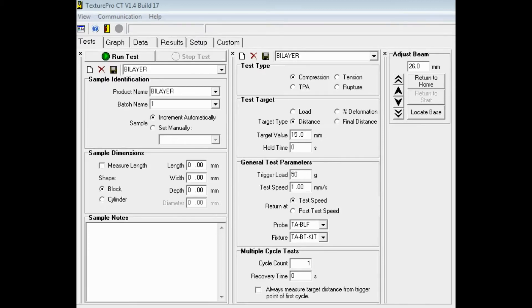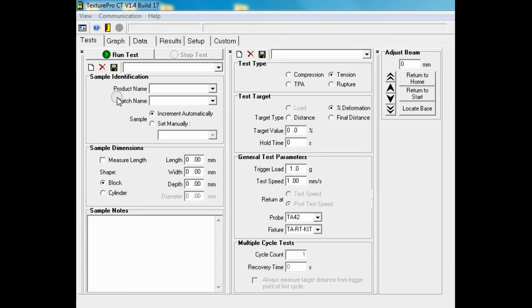The TexturePro CT software is very user-friendly and this video will demonstrate how to perform a test using this software. On the first column we can enter our sample description.